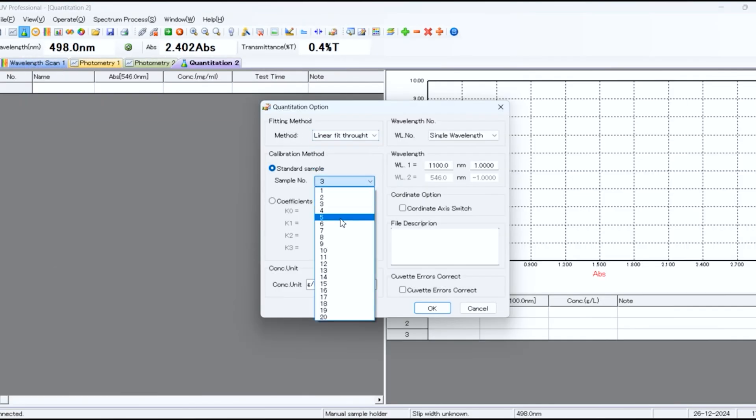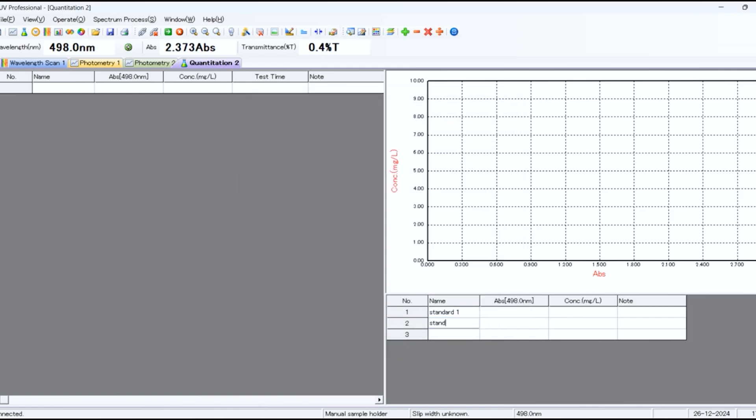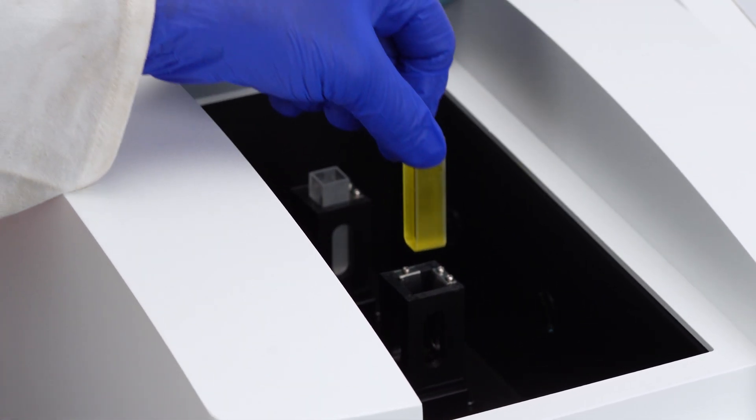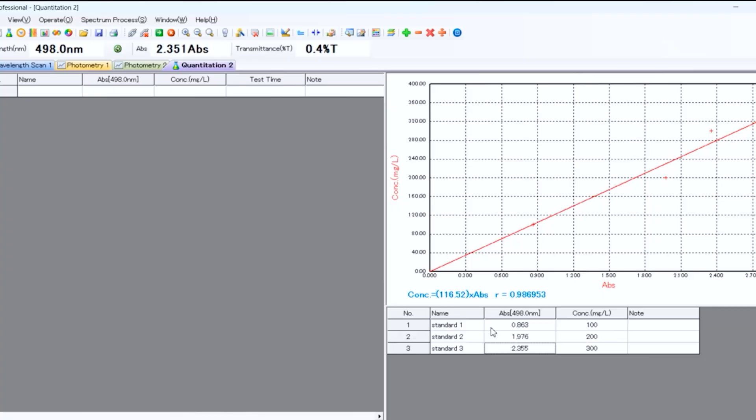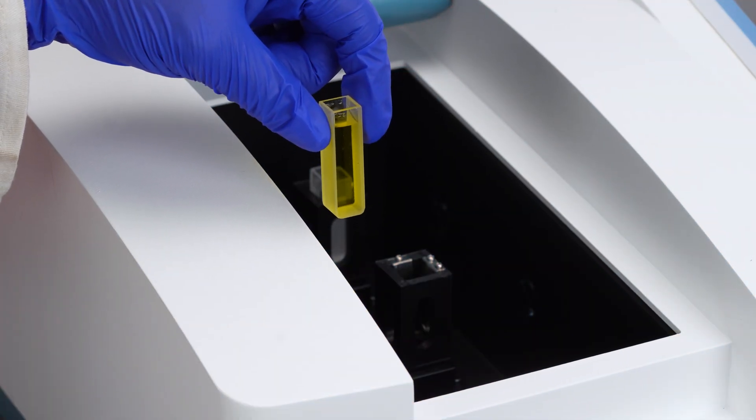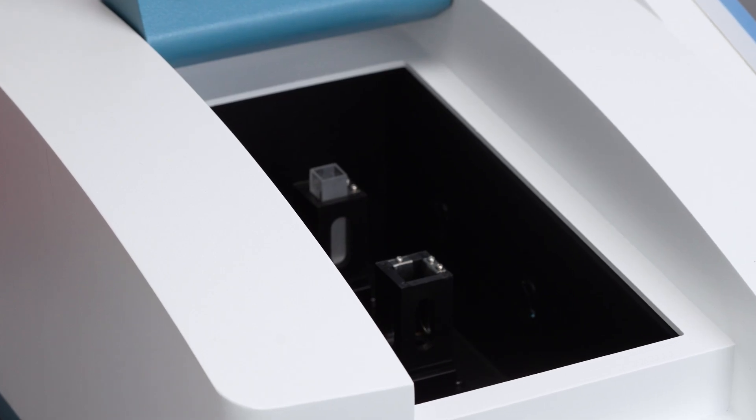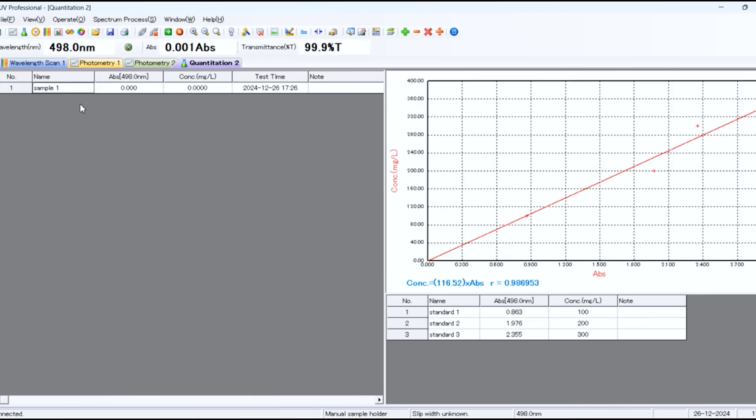Input parameters like fitting method, number of samples, concentration unit and wavelength. Enter standard concentrations on the right side of the screen. Blank the system and measure each standard sample. Once all standards are measured, the standard curve will be plotted. To measure unknown samples, blank the system again, insert the unknown sample and click start test.